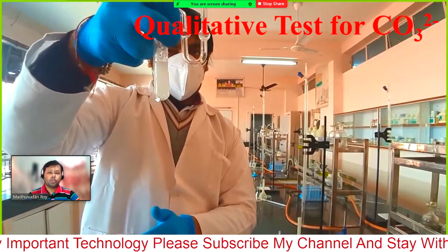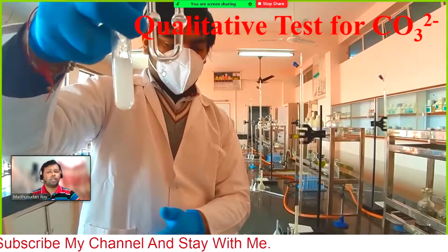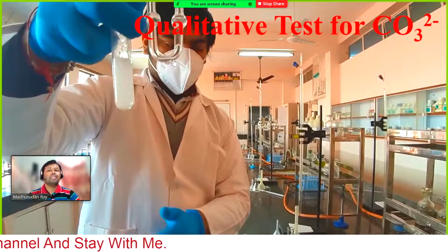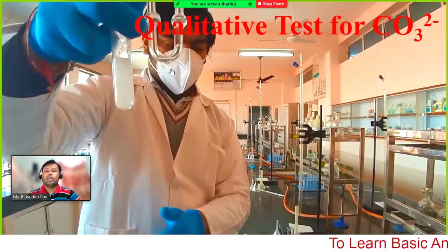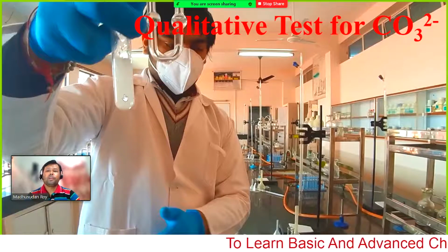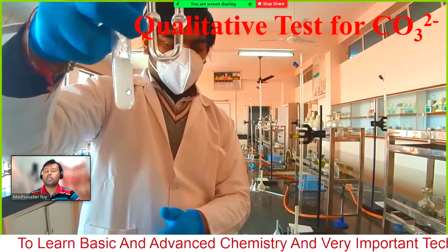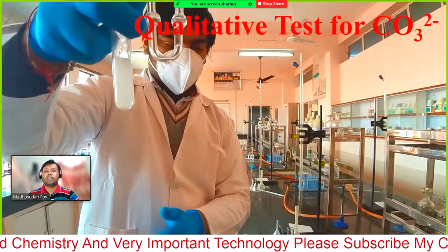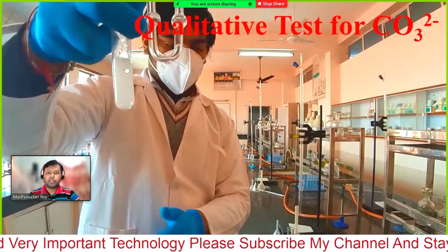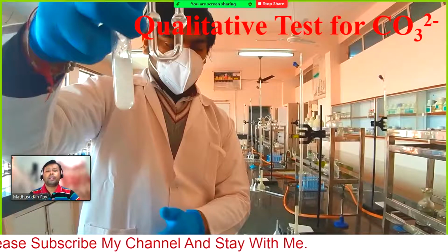However, you need to pass a certain amount of effervescence or gas through the lime water to make it turbid. Otherwise, you will not get the change in color. Therefore, he took a certain time to stop the mouth of the test tube, so he is not getting a very turbid color. However, if we perform this test, we will immediately stop the mouth of the test tube, so that we can pass most of the gas through the lime water. Even in this case, we can add some more acid or more salt in the test tube, so that we can perform the test again.